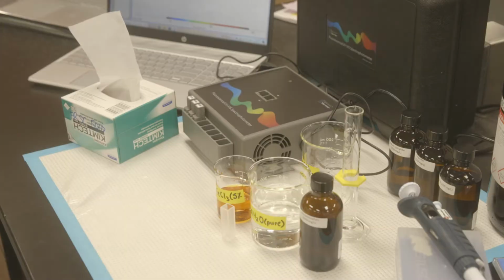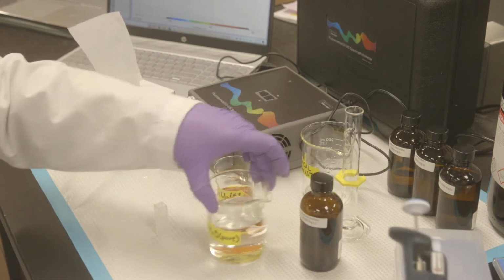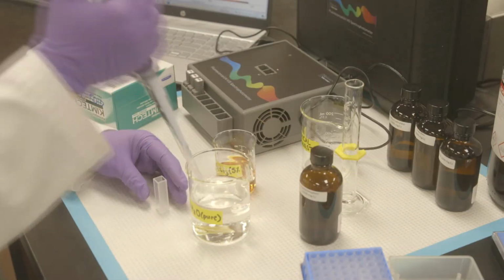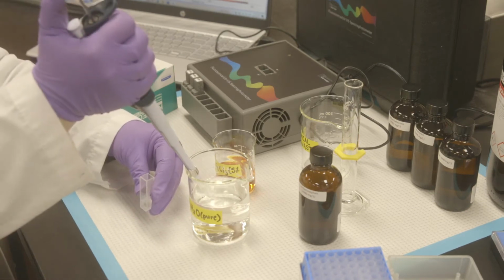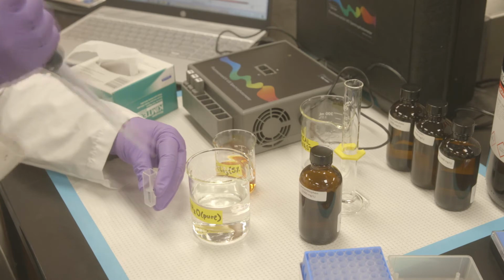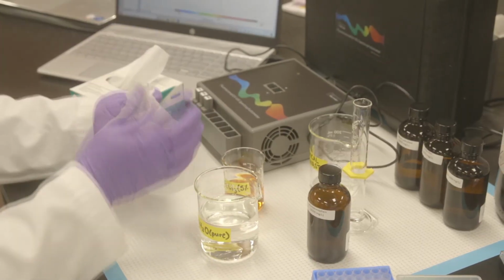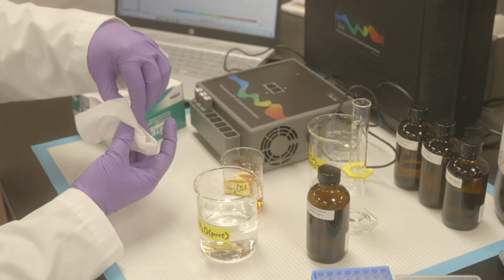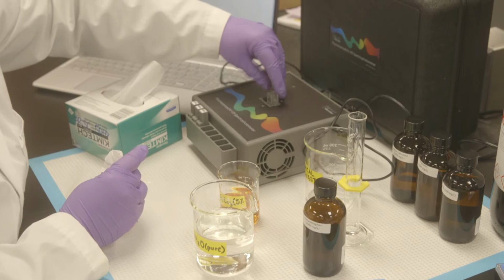For this lab, we will need to first calibrate the instrument using deionized water as the calibration solution. First, rinse the cuvette with water to ensure cleanliness, then pipette approximately 3 ml of deionized water into the cuvette for measuring. Before inserting, make sure to wipe the outside of the cuvette with a Kimwipe to ensure there is no residual solution or other markings that could interfere with light transmission.